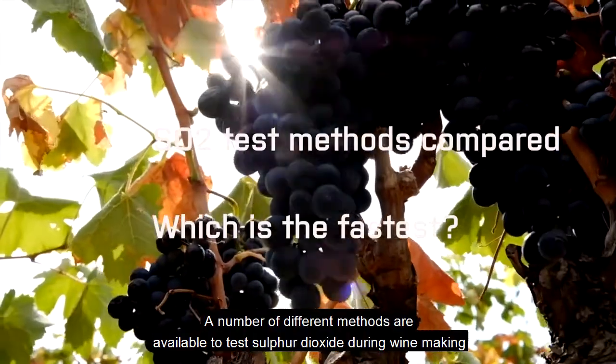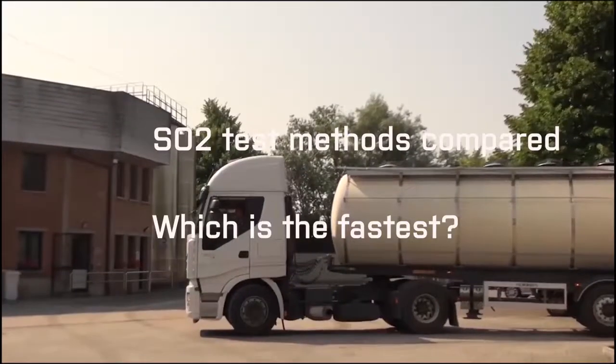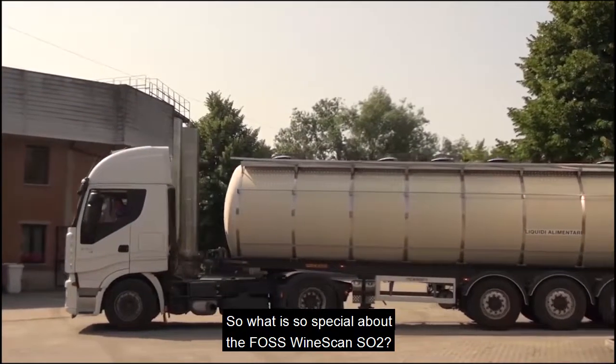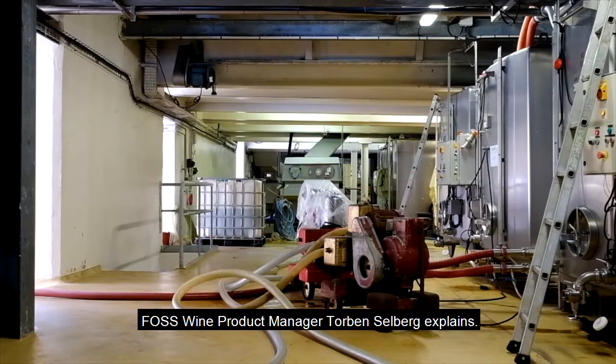A number of different methods are available to test sulfur dioxide during winemaking. So what is so special about the FOSS Winescan SO2? FOSS wine product manager Torben Selberg explains.